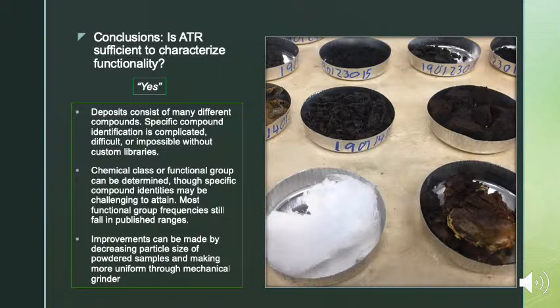Now, even though there are challenges with heavy inorganic components, there have been a number of instances where largely organic samples have been accurately identified by ATR by comparing with transmission library spectra using only the relative intensity correction. And while I didn't have time to demonstrate this in my project here, it's also feasible to get more reliable library searches by doing region searches on the ATR relative intensity correction spectrum and comparing them to transmission reference spectra in the libraries. For other more difficult to characterize samples, additional information comes from supplementary techniques.